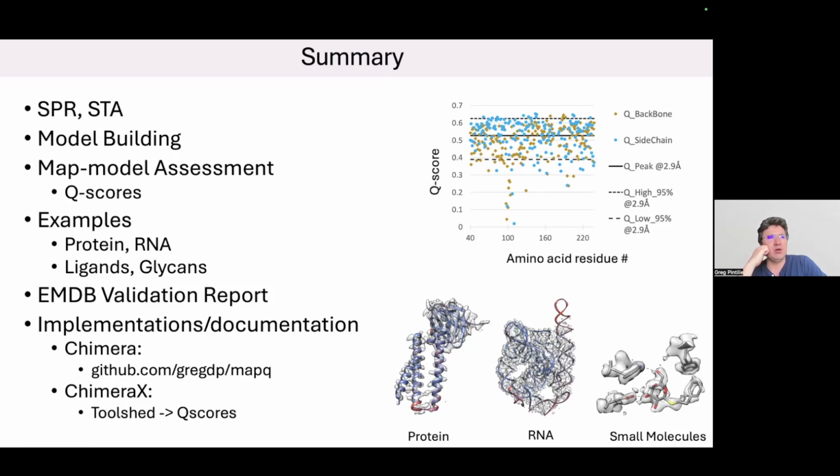The CaBLAM score that we saw in MolProbity can also be useful, but I think that's more useful for areas that have secondary structures. Looking at interactions can be useful. Is there hydrogen bonding in those areas? So I think the model parameters will be more important in those regions.